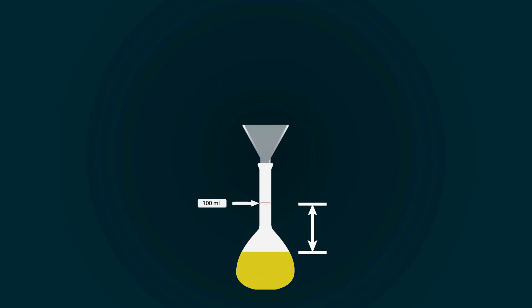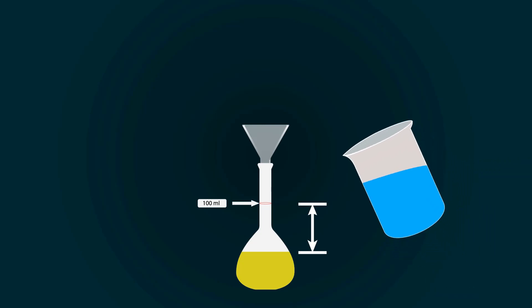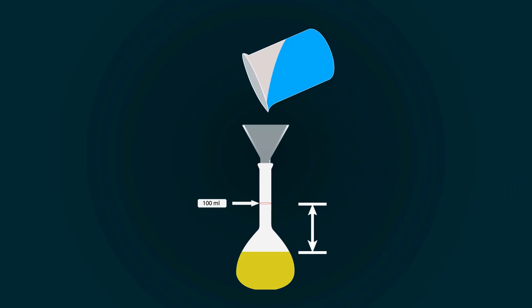For that, you have to add more distilled water in it. So take some distilled water into an empty beaker and pour it into the volumetric flask to fill it up to the 100 milliliter point.